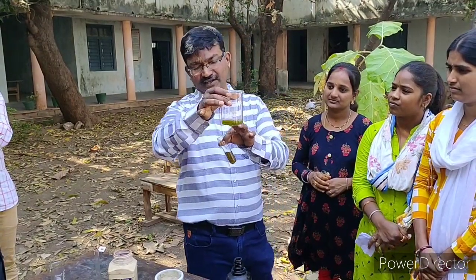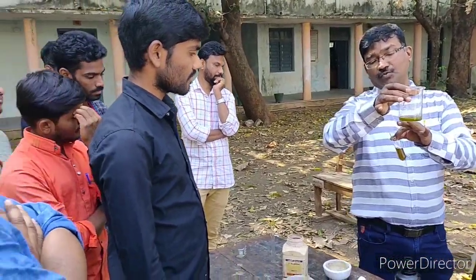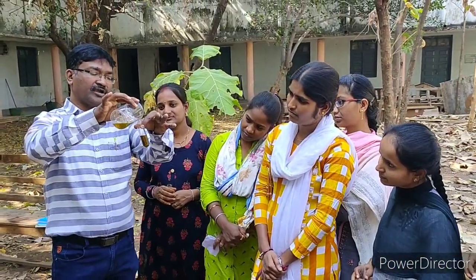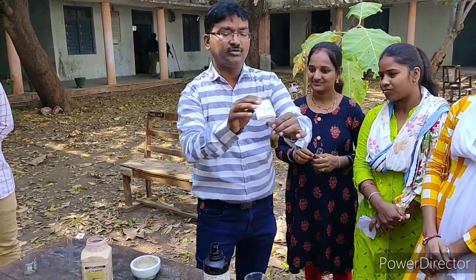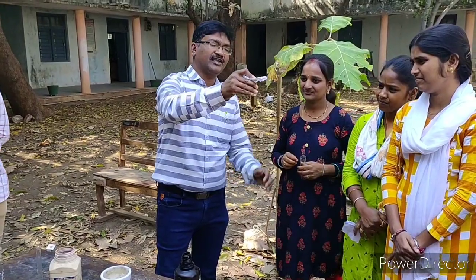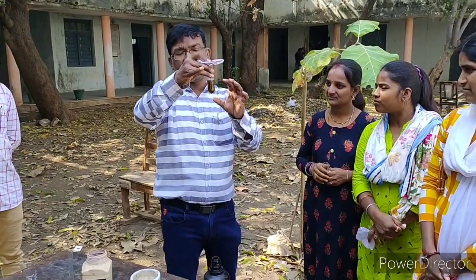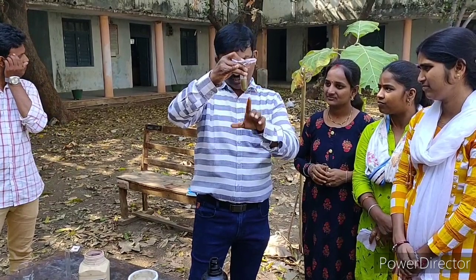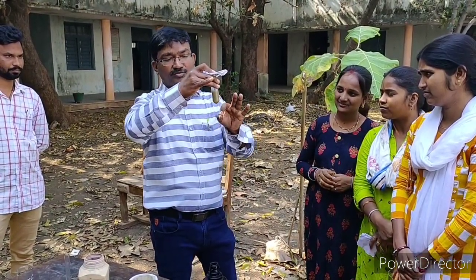Dimethyl sulfate is a methylating agent, meaning it substitutes the methyl group. We have to add the dimethyl sulfate to this boiling tube and shake it vigorously. It is an exothermic reaction, so be careful. That is why we have to add the dimethyl sulfate in very small amounts, many times.